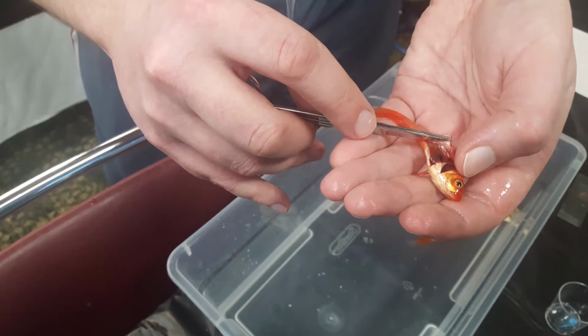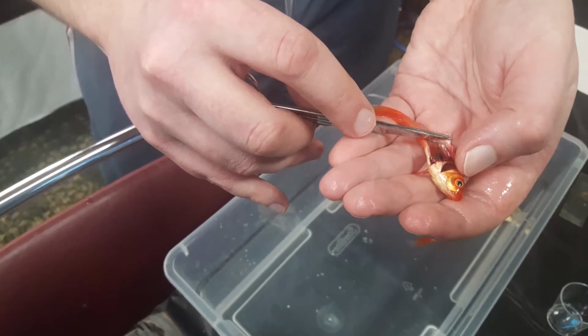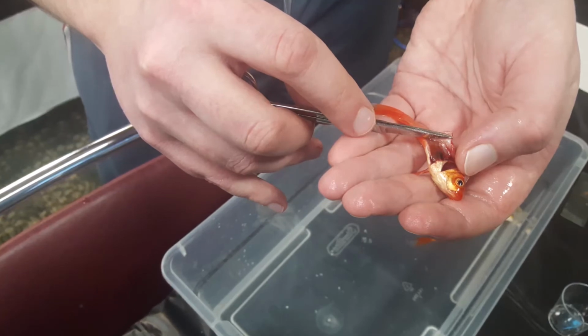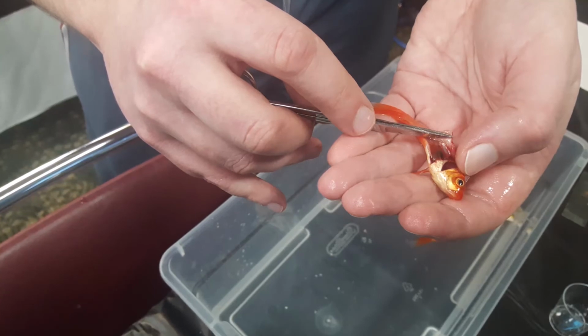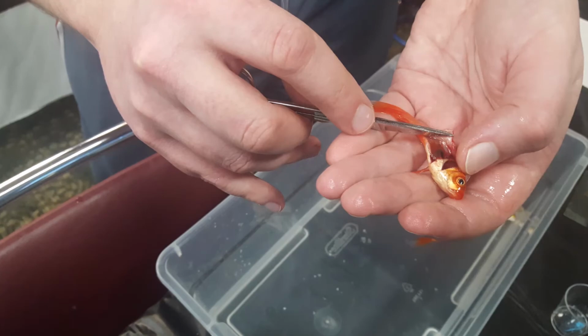On this next clip, you can actually see Dr. Johnson walking me through doing a necropsy on a koi, which is really cool for me because I've seen one done on a horse before, but not a koi. So he walked me through how to necropsy a koi, and he actually helps his clients and customers. If they can do this procedure themselves, they can send pictures to him, and he will help them determine what caused the death of the koi so they can save the lives of their other koi.